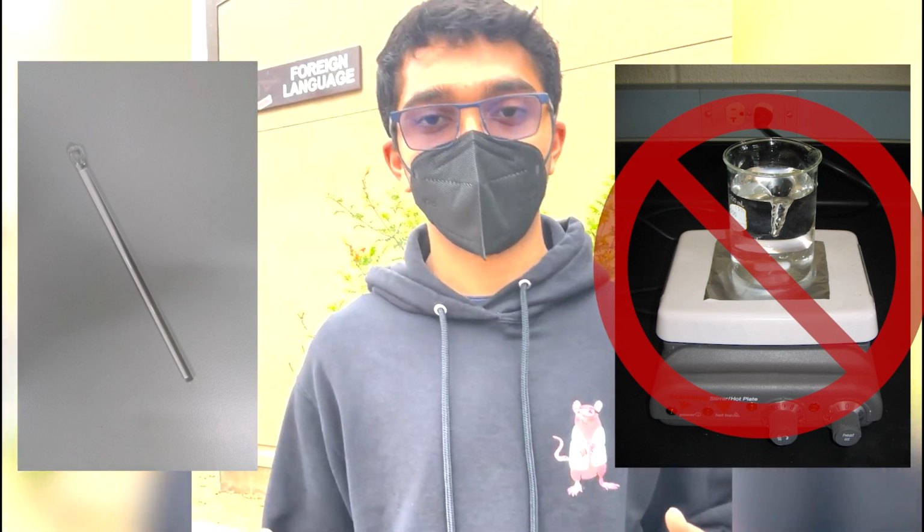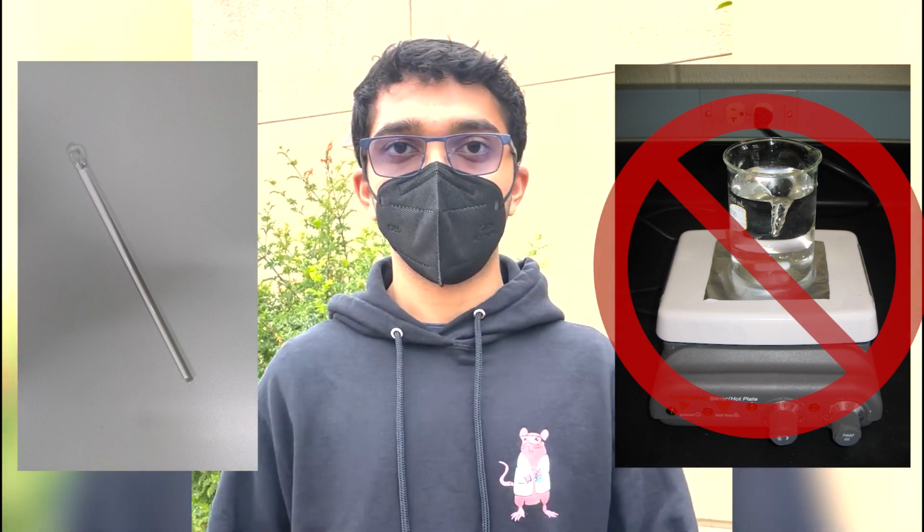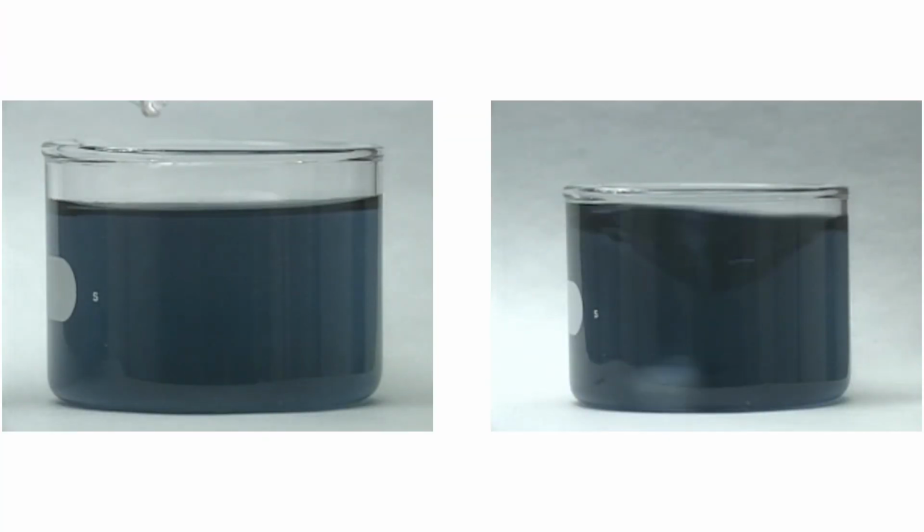In our experiment, we stirred the solution with a stirring rod instead of a magnetic stirrer, but the result should be roughly the same. Without stirring, the reaction will not be spatially uniform, instead going from top to bottom, as shown in the video.